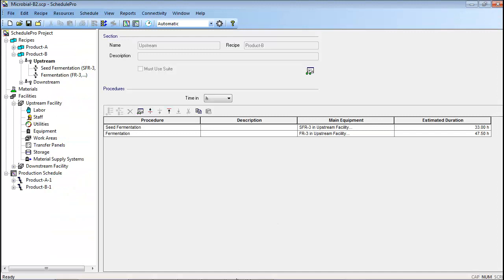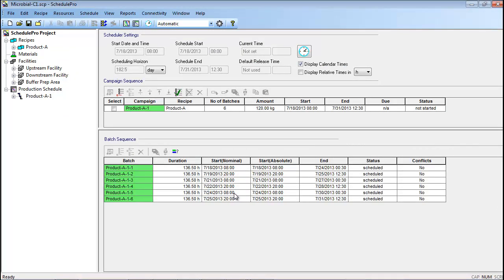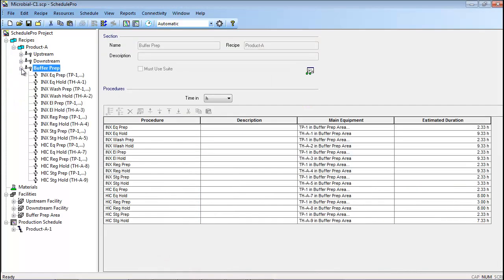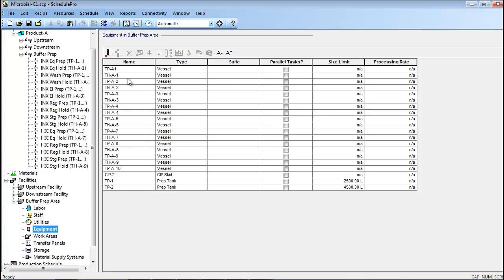This next set of cases incorporates buffer preparation and holding activities into the production schedule. It is assumed that each product requires eight different buffer solutions: five buffers for the operations in the ion exchange chromatography procedure, and three buffers for the operations in the hydrophobic interaction chromatography procedure. For the sake of simplicity, the Product B recipe shown in the previous example has been removed from these cases. In case C1, the prepared buffers are each used within a single batch. As a result, a new buffer prep section has been added to the Product A recipe. Within this section, each of the buffers is prepared in a blending tank and then transferred to a holding tank. Note that since the buffer prep and storage activities will take place in different equipment from the main processing operations, an additional facility called buffer prep area has been added, and the preparation and holding tanks have been added to it.